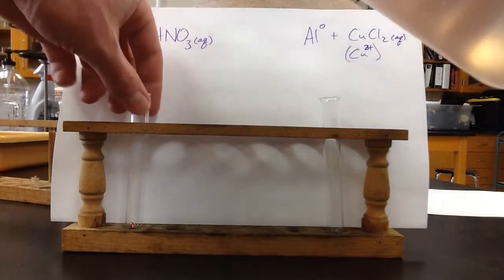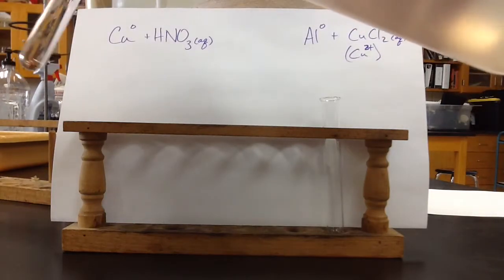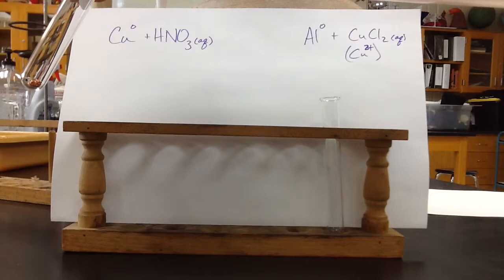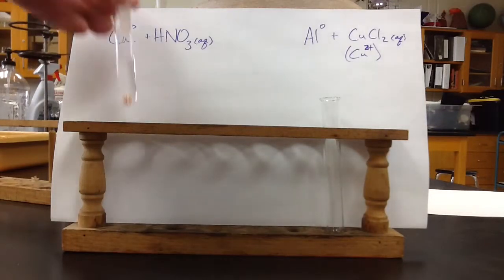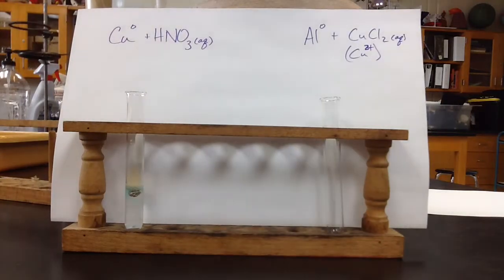See if I can do this without a funnel. Oh, that might be a little bit more than we need, but that's definitely going to get the job done. And so we can see the copper is reacting really vigorously right now, and it's producing kind of a brown gas, some nitrogen dioxide I think, and not great to breathe in. There's only little, and I'm not breathing it in.